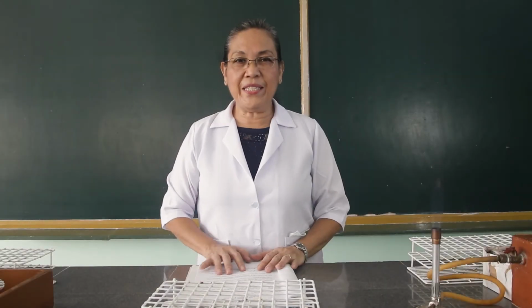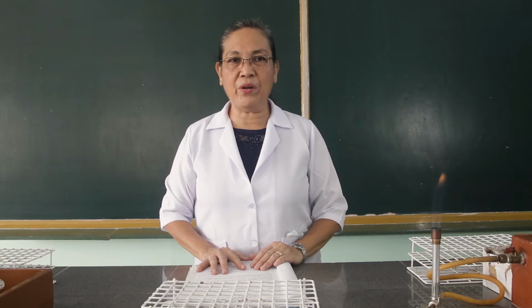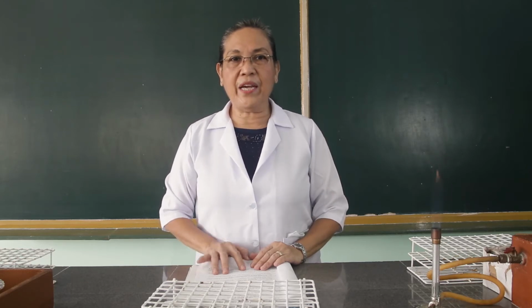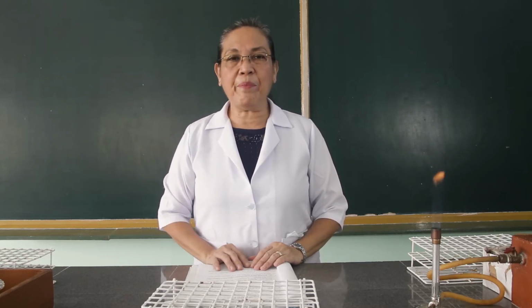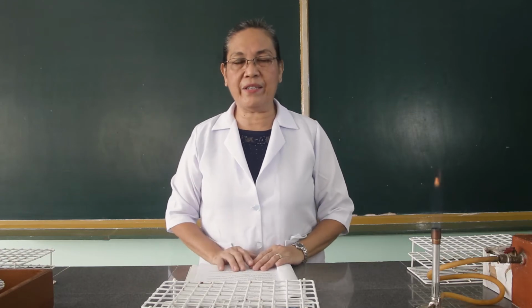Hi, good day. Welcome back to our class in Chemistry 102B. Today, I will be performing a pre-lab lecture on the activity, the analysis of group 4 cations.